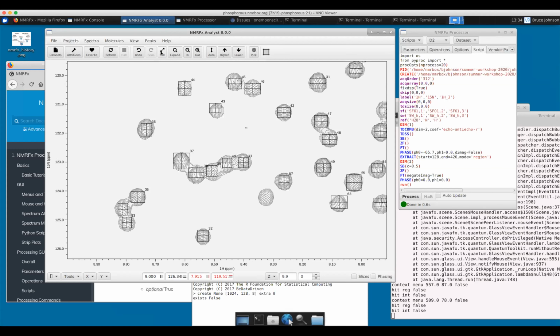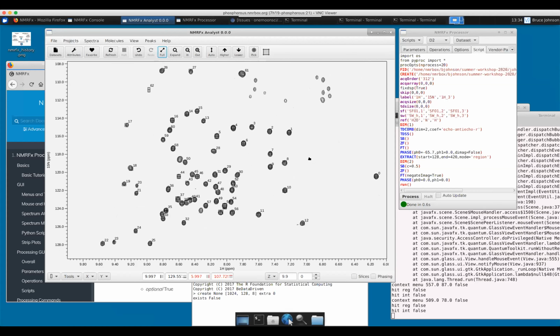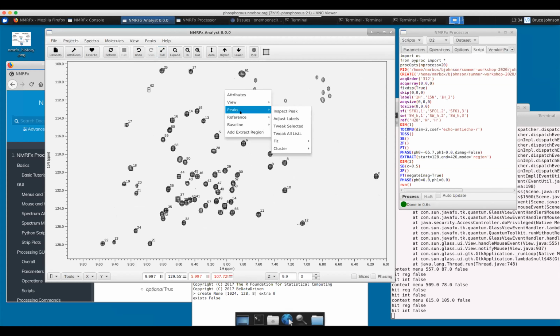So that is the final way to do it. Actually, there is one more way. It's still sort of experimental. If you do fit planes exponential, it is fitting simultaneously the decay. So then it's actually fitting the peak position, the peak width, and the exponential decay.